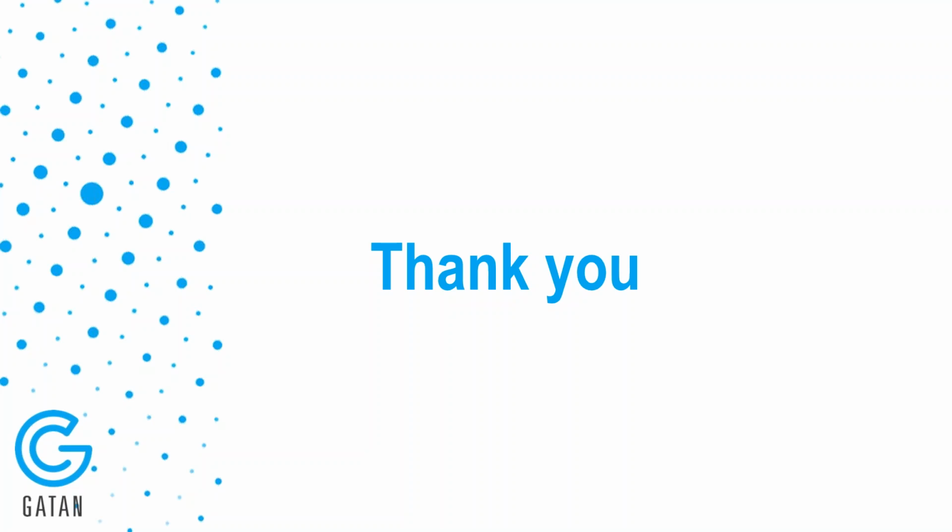The advantage that a TEM has over an SEM is that because we're using electron transparent samples, so very thin samples, when the incident electron hits the specimen and interacts with it in some way, it very soon after leaves the specimen, and so it doesn't have a chance to spread out within the sample. So we overcome many of those interaction volume limits that we talked about earlier in the presentation.